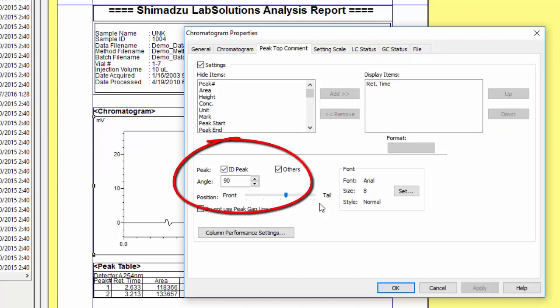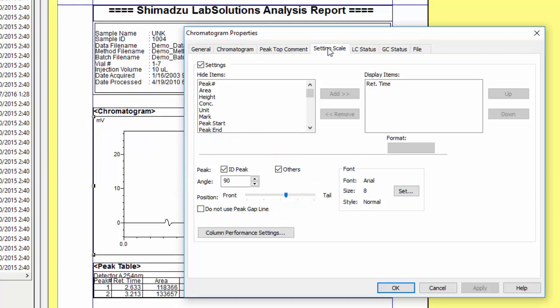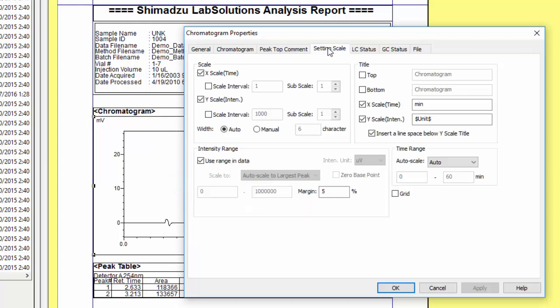Under the setting scale tab you have additional customization options for setting the time scale and intensity scale. You can, as in the chromatogram tab, select the intensity range automatically or manually. You can also scale the overall time automatically or select a specific window of time manually.